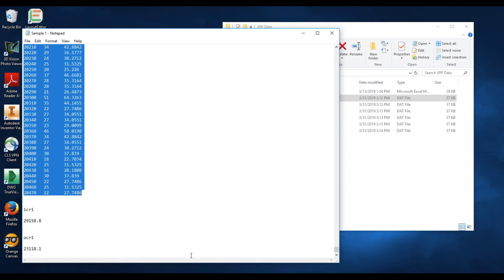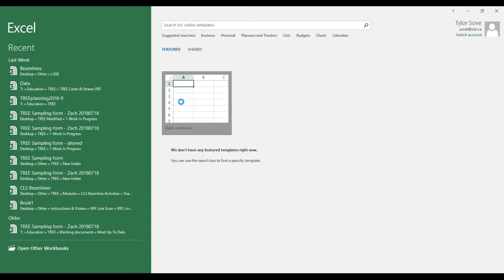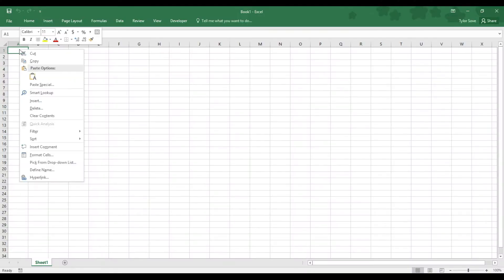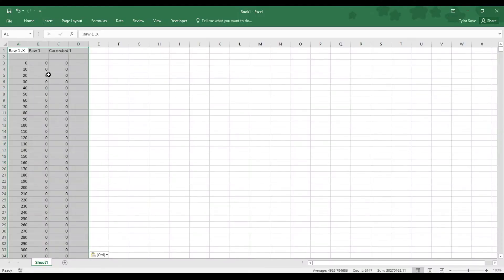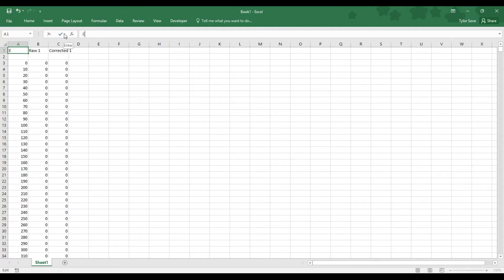Now we need to paste it into Excel. So open up a blank Excel workbook, and in cell A1, right-click and select paste. That's how we'll import each sample file in, but before we move on to the next one, we need to rename a few things. RAW1X in cell A1 should be renamed to EnergyEV, as this is the energy detected by our detectors.